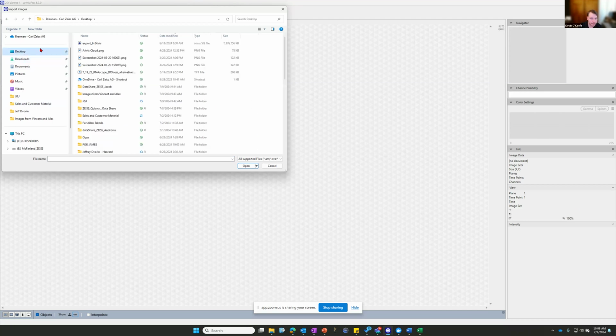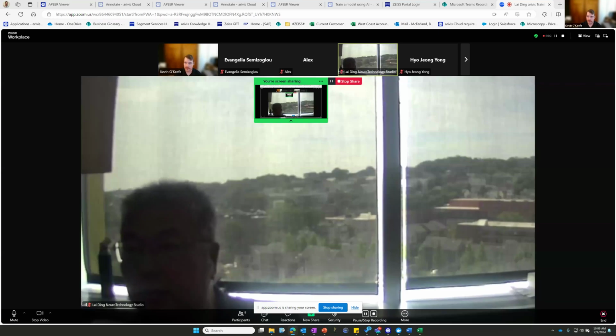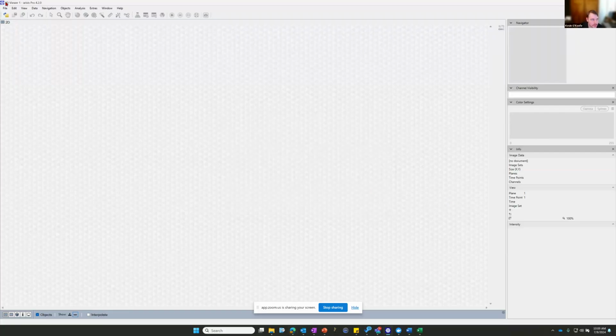Actually, let me stop sharing for a quick second. Let me load an example data set here. Maybe I'll do this one here. There. Okay. Go ahead and share my screen again. Okay. So I went File, Import.